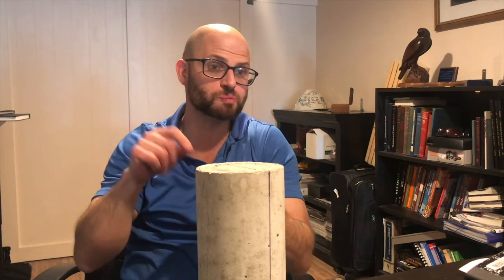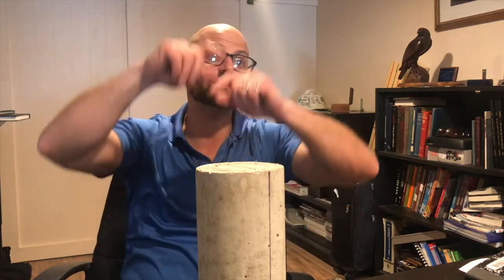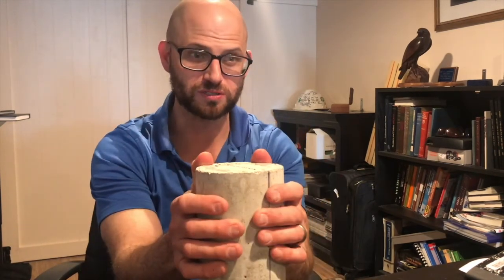Those electrons bounce off, and without going into the whole mechanics of it, a secondary electron bounces off that we capture onto a screen, and it creates a black and white topographical image. And that's what we're looking at right here. And it's really cool to look at. But the question is, what does it mean, and how does it relate to the real world?